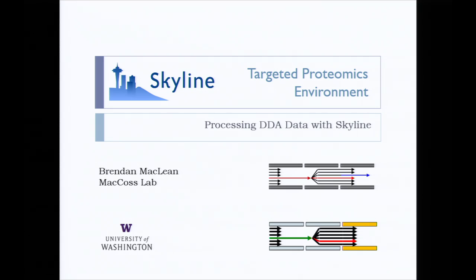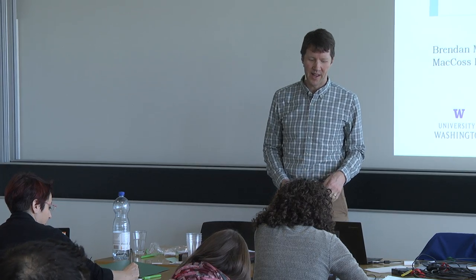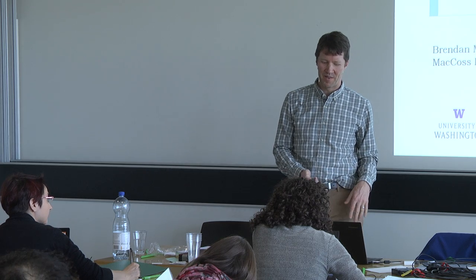Welcome back. So I figured for the last SkyJam, we would do something that involved another group comparison, and we'll actually interrogate some DDA data because, as Lucas mentioned, we still, as labs, generally generate a lot of DDA data, and if you want to look at it quantitatively, that's possible in Skyline, and it's sort of the one thing we haven't covered.